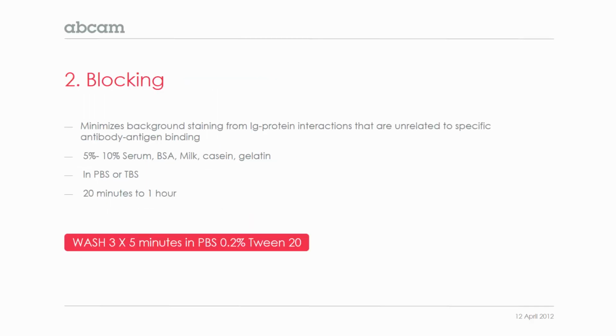So the blocking step is there in order to minimize the background staining from any protein-antibody interactions, and these are not specific to antibody-antigen binding. So any non-specific binding you're trying to eliminate.